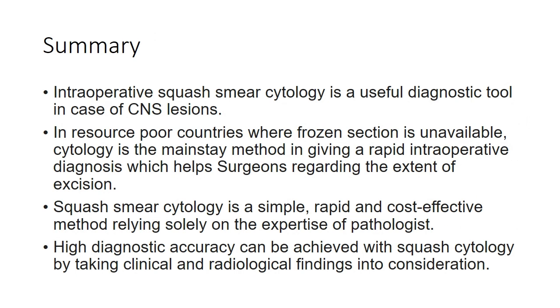So eventually summarizing, intraoperative squash smear cytology is quite a useful technique, especially for CNS lesions, which are quite soft in consistency and easy to smear. In a resource-poor country where frozen section is not available everywhere, squash cytology can be a mainstay in providing a rapid intraoperative diagnosis to the surgeons regarding the extent of the excision.